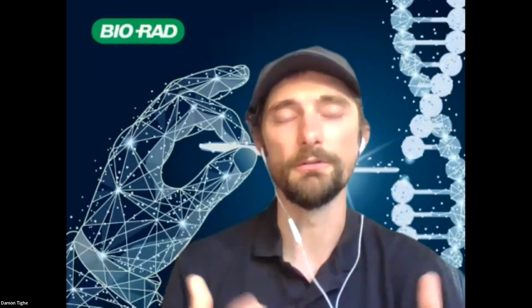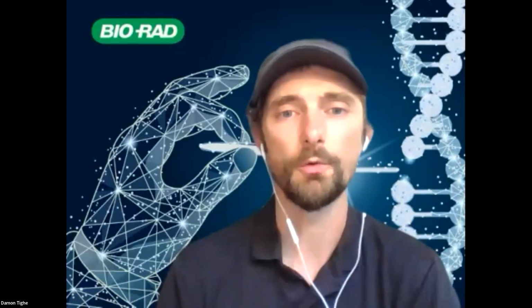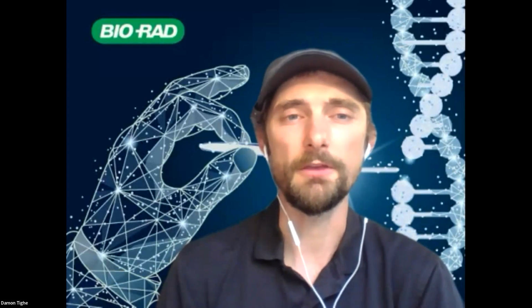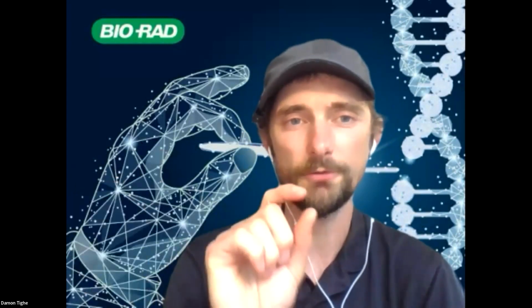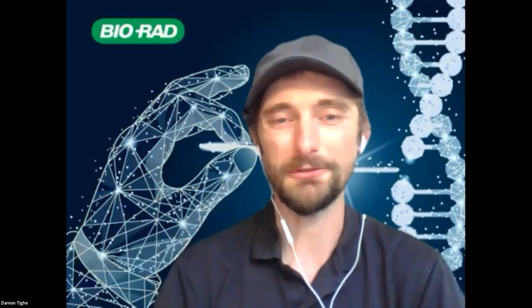Is there anything that you have to worry about, Damon, with the PBS or anything being cold? Not really. The only thing I'd worry about with cold is any sort of condensation that might take place in the cuvette. But with any sort of protein lab, you always want to let things get to room temperature before you start to work with them. The only thing you might take straight from the fridge and use right away is the standards, but that's going to be 20 microliters going into a full mL. The temperature on that is just going to fade into the background, so you don't even have to worry about that.